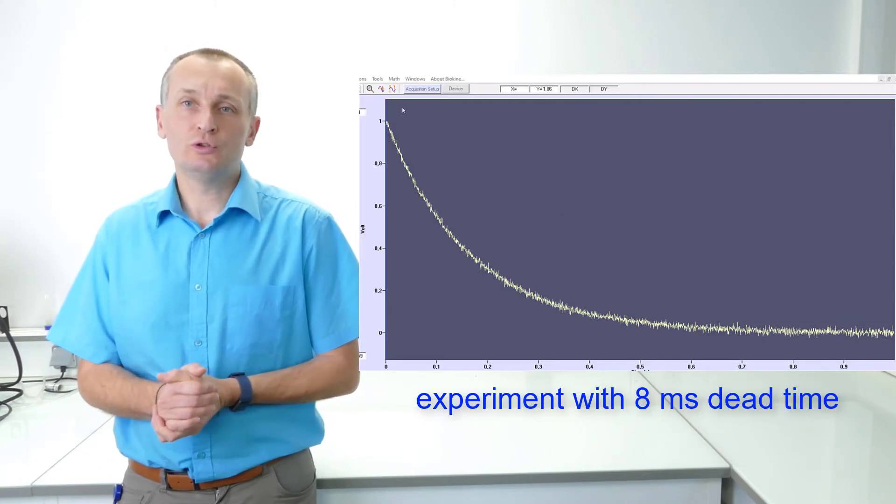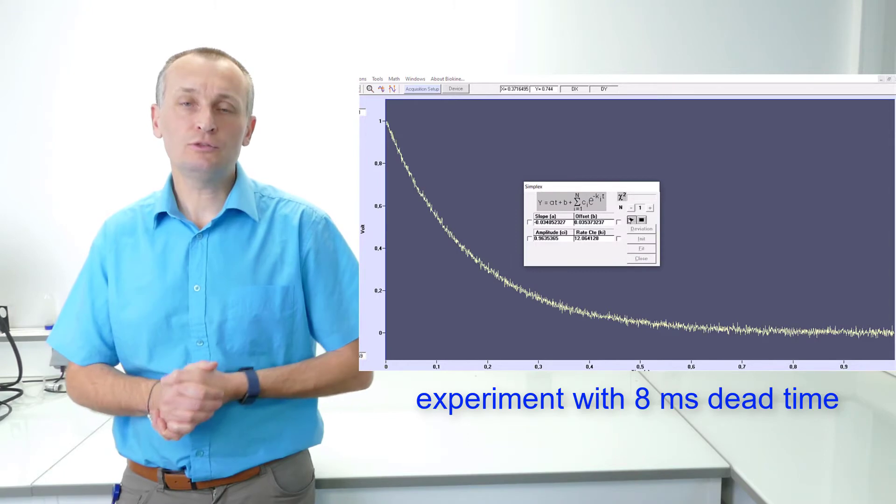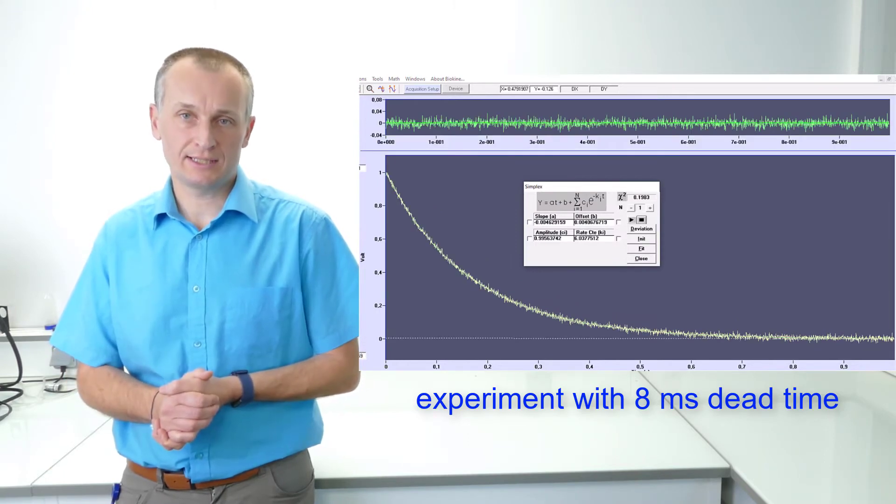This is an example of a trace you could obtain with an 8 ms dead time. The data looks good, and it could be fitted perfectly using a single exponential.